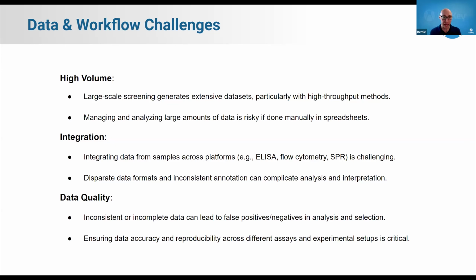And managing and analyzing large amounts of that data manually in spreadsheets can be risky. Mistakes are definitely made, and it's certainly time consuming.